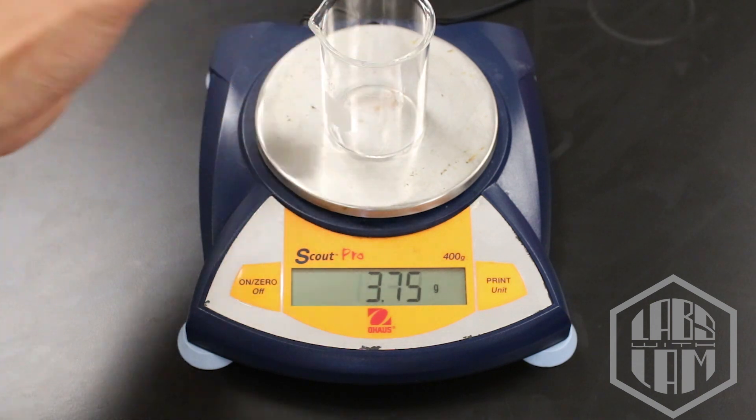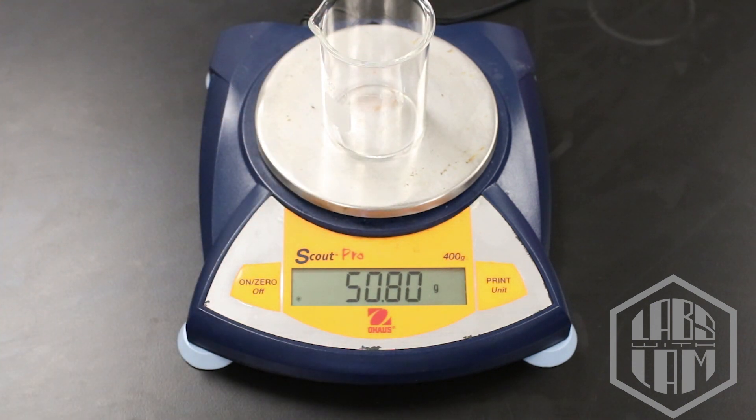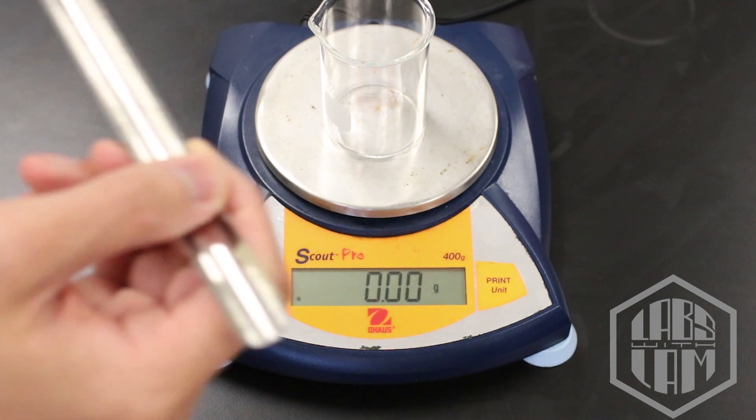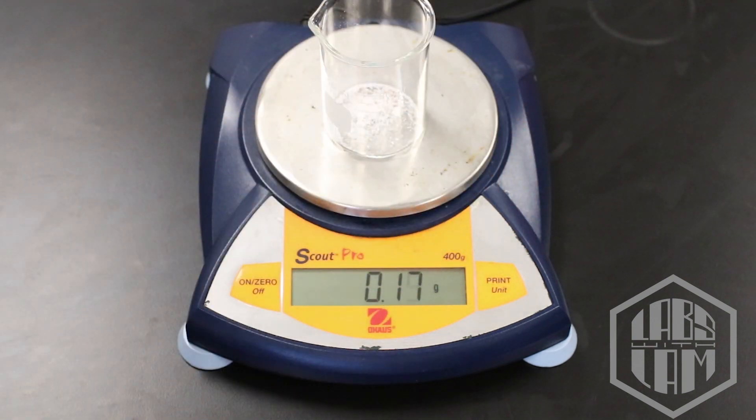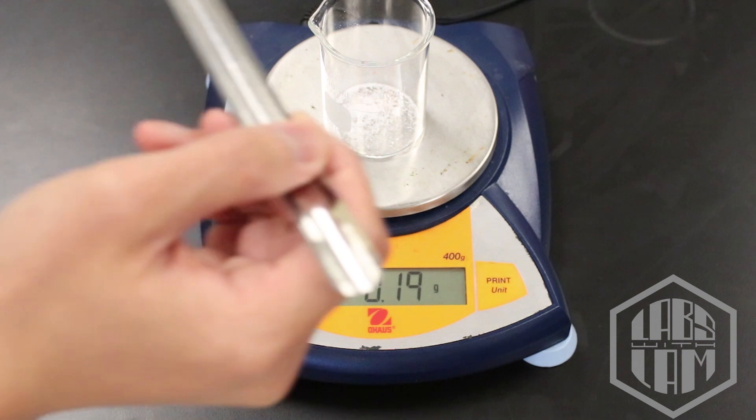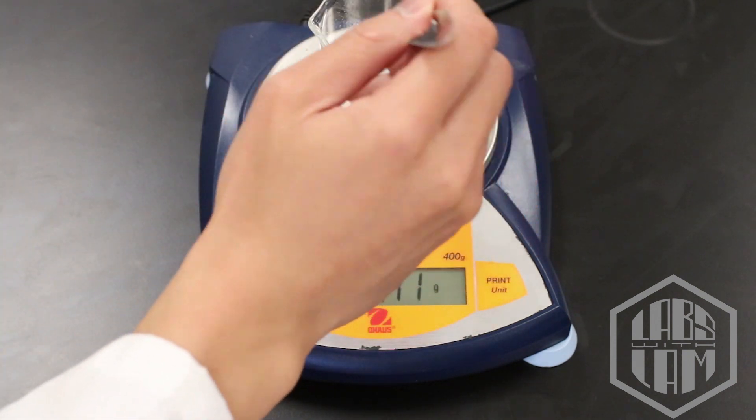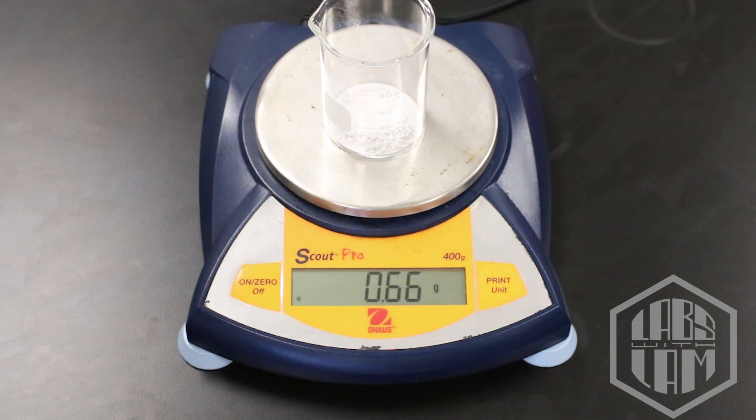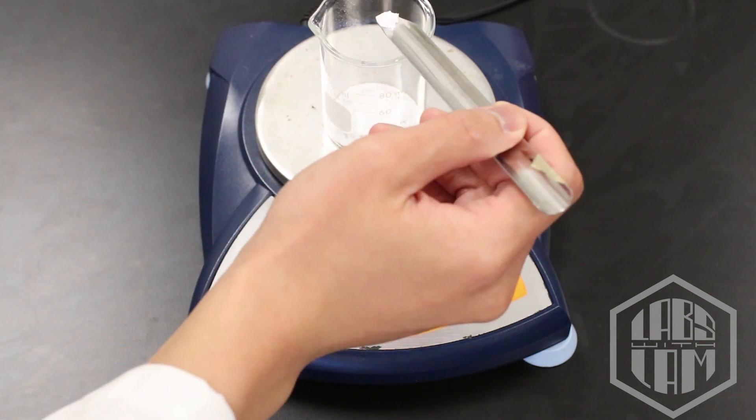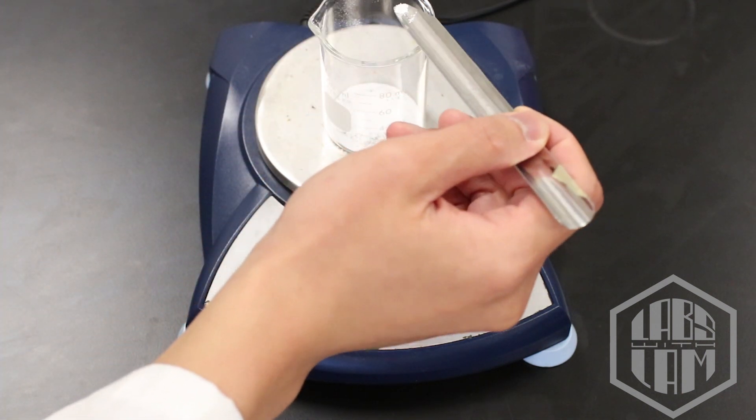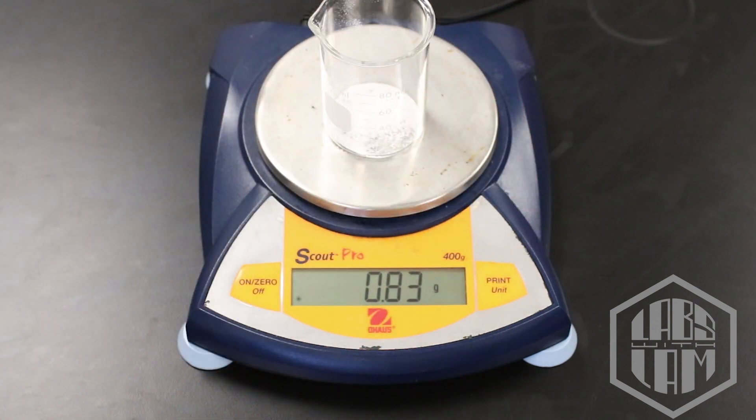Next up is our beaker. I don't actually need the mass of this, so we're going to zero it out. This will let us determine the mass of the sodium carbonate we're going to put inside it. We're aiming for about 0.80 grams, but we want to record what we actually use. Overshot it a little bit, but that's okay. Make sure you record what you actually used, not what you were aiming for.